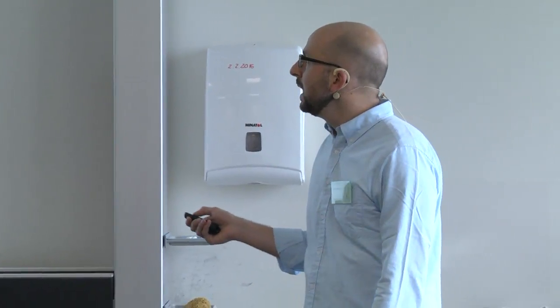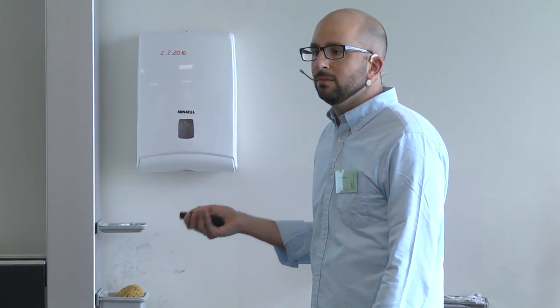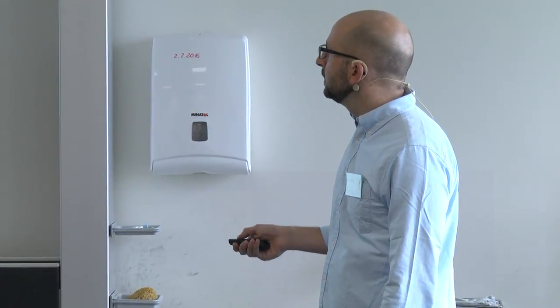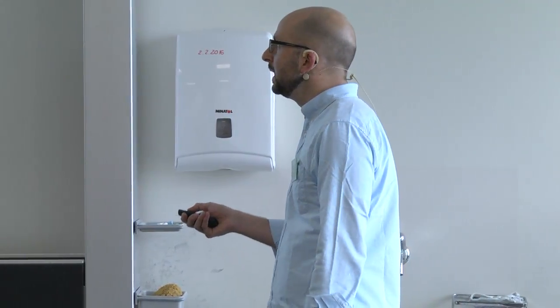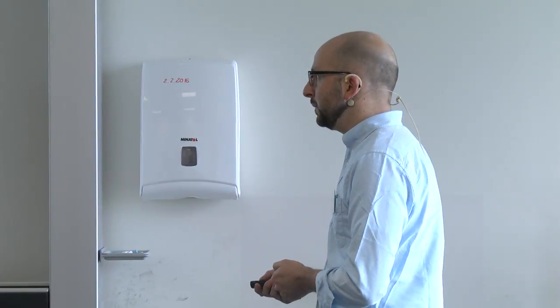We need to think how many transitions we're going to choose per precursor. The more, the merrier, and that will increase the likelihood of selectivity. And whenever we look at the smaller types of ions, so the Y3, for example, or the B3, then it is likely to be, or it can be, less selective. That doesn't mean that it's not very good for quantification. It can be a very useful and very abundant ion for quantification, but for selectivity, so being informed that this is the right peptide, it might not be useful.